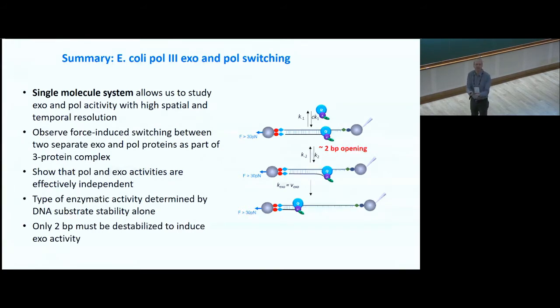You know, why isn't it advantageous for it to just detect the first one, or if there's a second one that's matched, still see that it's there? I don't think it would be the same if there's a second one. It depends on how much that means the DNA is destabilized. If there's a second mismatch, it probably frays open pretty consistently.